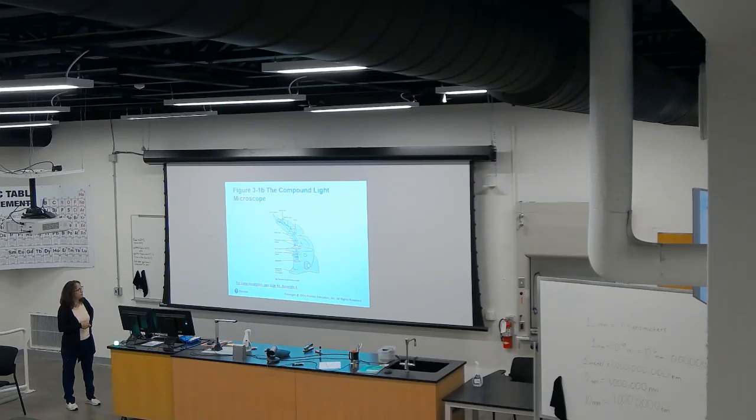And then the light will be refracted going into this objective lens that makes these rays of light go into this prism inside the body tube that has that physical property of bringing the path of light towards the line of vision in the ocular lens.